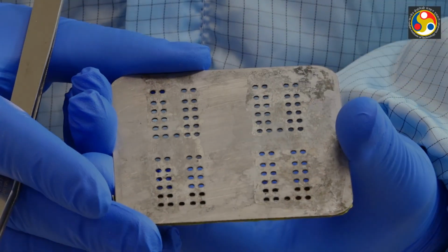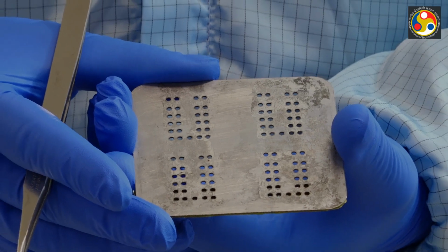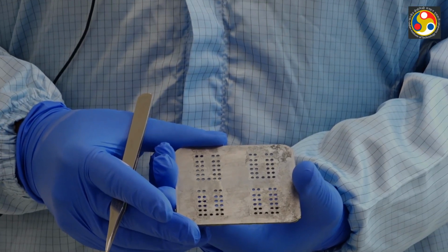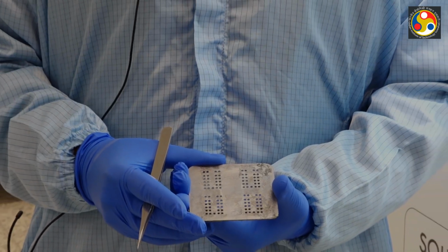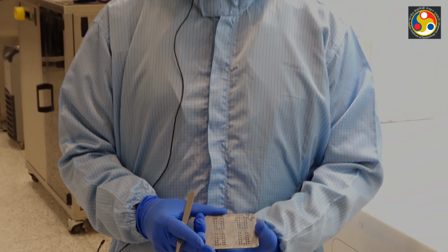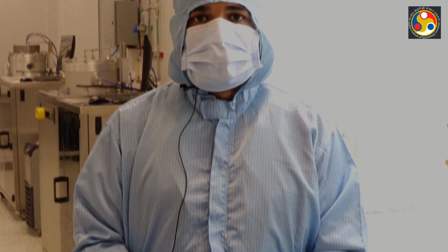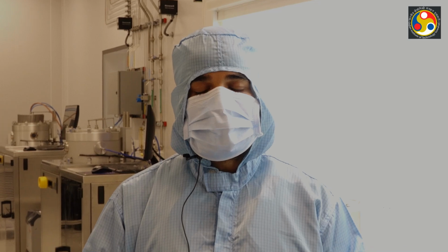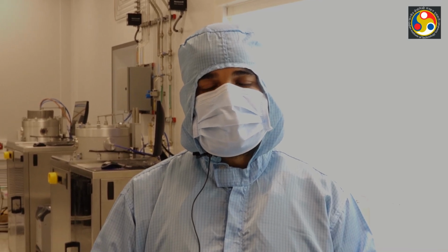So these are the samples for our PECVD deposition. We are going to deposit silicon dioxide through PECVD process. These are the silicon wafers which we have thoroughly cleaned, followed by acetone and IPA ultrasonication. Then we dried it in nitrogen stream and heated it up to 150 degrees for 10 to 15 minutes.